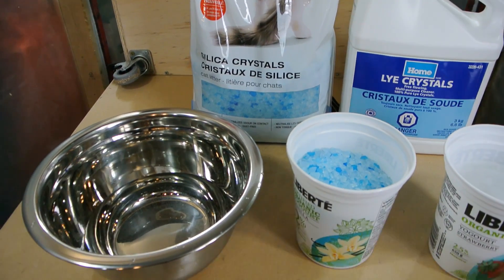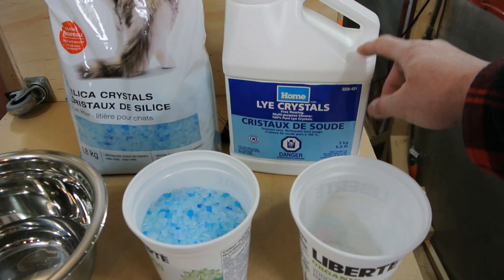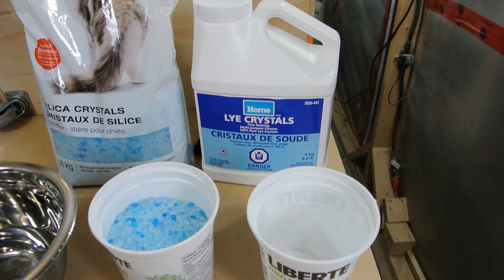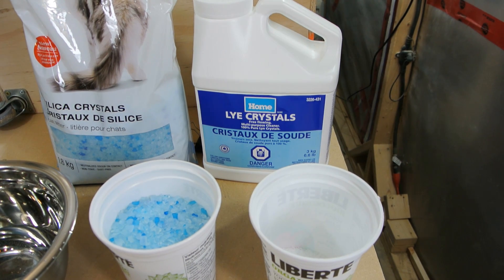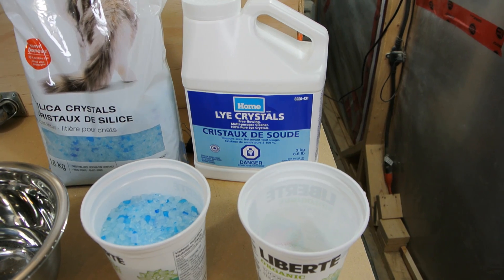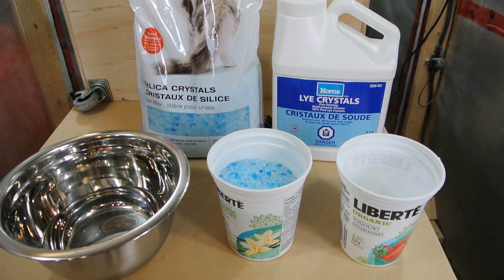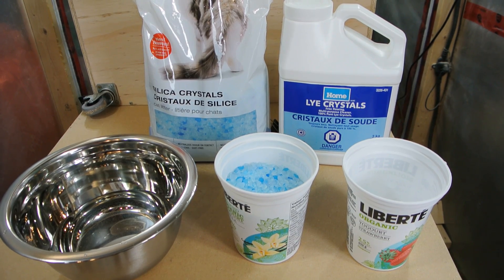Do it outside because when you add lye to water it causes a chemical reaction. This is the same stuff typically in drain cleaner, but now they mix other chemicals in with the drain cleaner so it's not just pure lye - at least in Canada. So I'm going to set up and start adding all the ingredients together and see what we come out with.